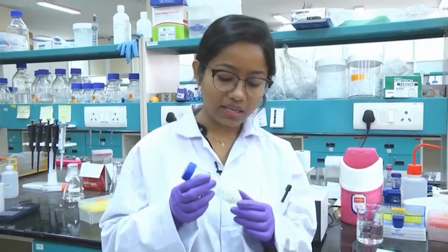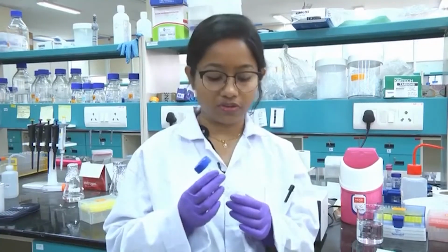Along with that you might have some other ingredients in the buffering system depending on your need. If the protein you are using has a specific need, go for a literature survey and see what other people are using for that particular protein, and depending on that you can add those things. Sometimes people use EDTA so that the divalent ions are chelated out and do not hamper the protein purification.